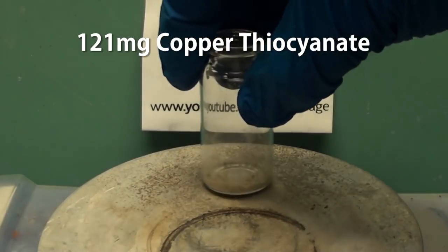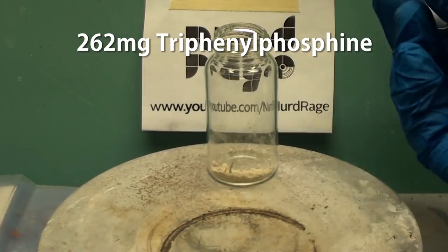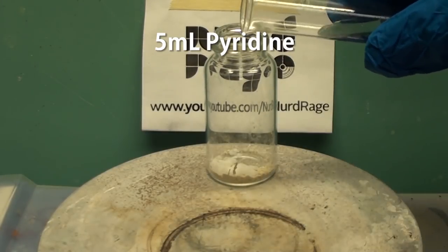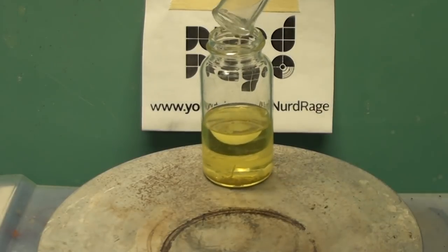First get 121mg of copper thiocyanate and 262mg of triphenylphosphine. Then add to it 5-10mL of pyridine. I'm using 10mL of pyridine for clarity but you can use 5.